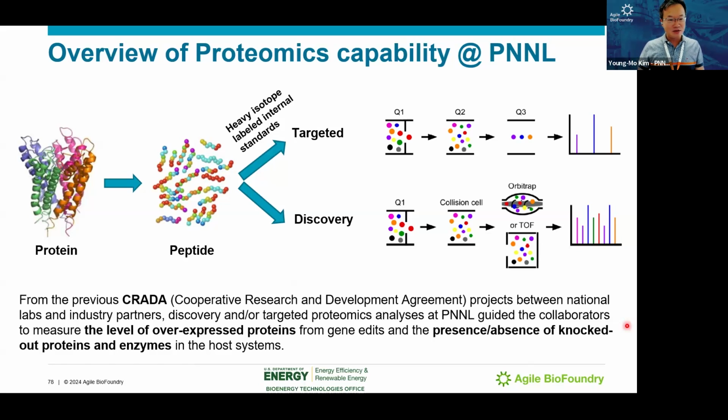As we wrote down at the bottom, we have a lot of CRADA projects, and we really helped our collaborators. We guided them to measure overexpressed enzymes and proteins, and during their promoter improvement, we were able to see their ups and downs. The collaborator told us that it's really helpful for further gene modification and engineering.